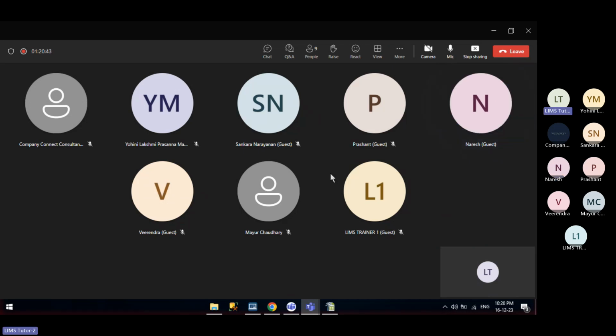Yes. So what the organization thinks is, when an auditor is performing an audit, he will have all the data available in a single application. There are n number of applications used in the organization: LIMS, Caliber, CDAS, EDMS. Most of these applications have facilities for investigation, incidents or OOS handling.